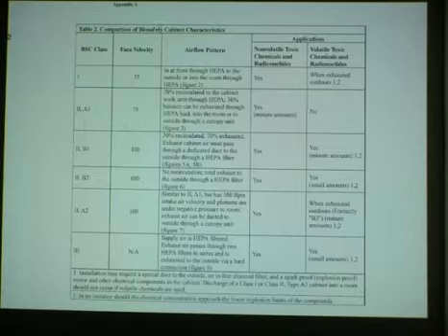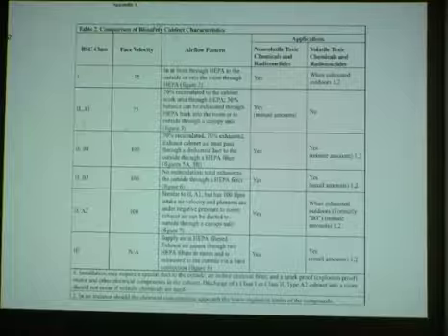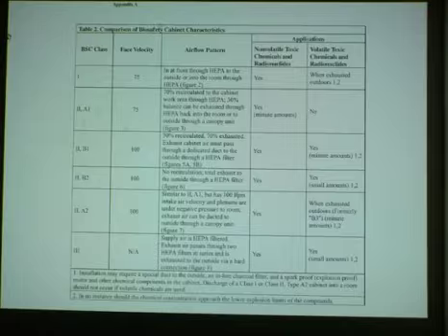Finally, you have the BSC class 3 biosafety cabinet, where there's no question of any face velocity because no room air directly enters the cabinet. It is through a HEPA filter and all the air is exhausted outside. In the case of a class 3 biosafety cabinet, it is like a glove box. You have gloves. There's no laboratory air directly entering the workspace or the cabinet. The air going into the cabinet is HEPA filtered and the air coming out is also HEPA filtered. So there's no question of laminarity inside that particular cabinet. The air is bio-clean, but the airflow is not laminar.